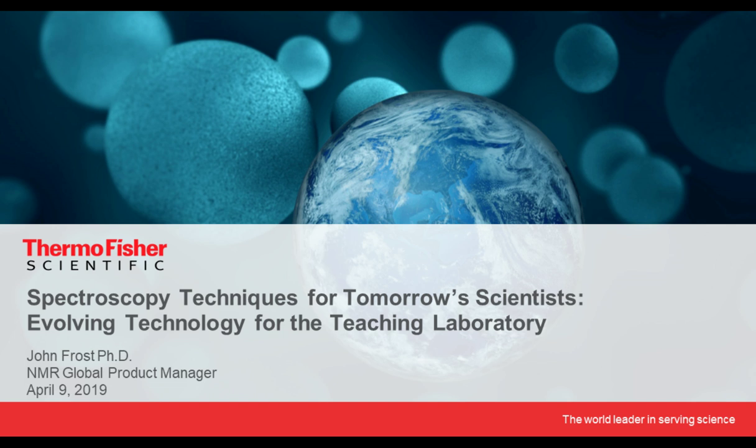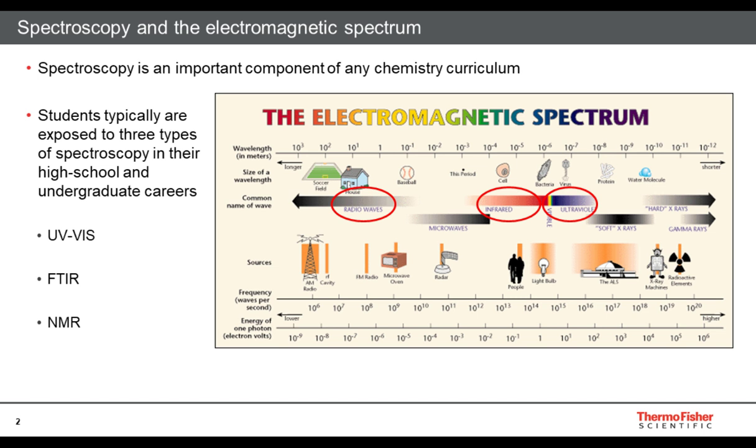Thank you for that kind introduction. So today's webinar is Spectroscopy Techniques for Tomorrow's Scientists, Evolving Technology for the Teaching Laboratory. We're going to briefly review some of the most common spectroscopic techniques in the chemical sciences curriculum, how they fit in the curriculum, some examples of laboratories and ways to communicate the technique to your students, and a few examples of how they're used in the real world.